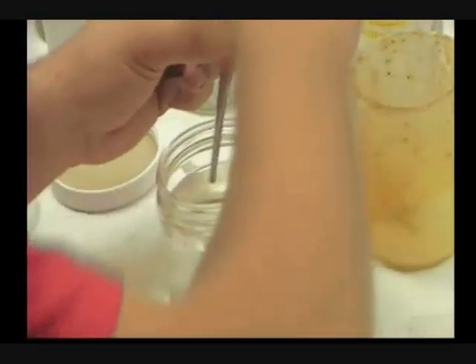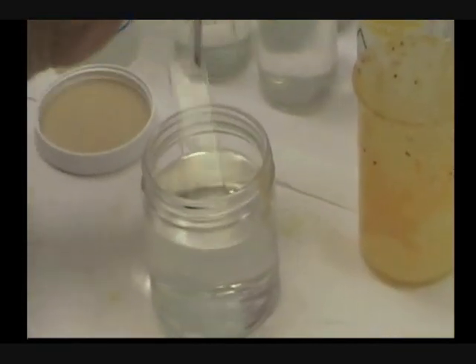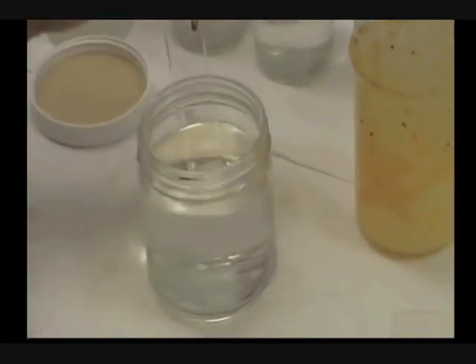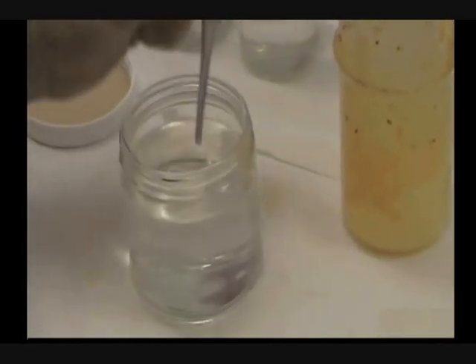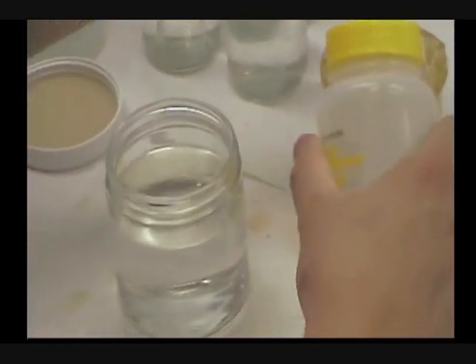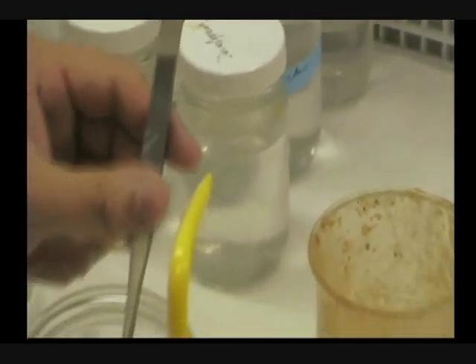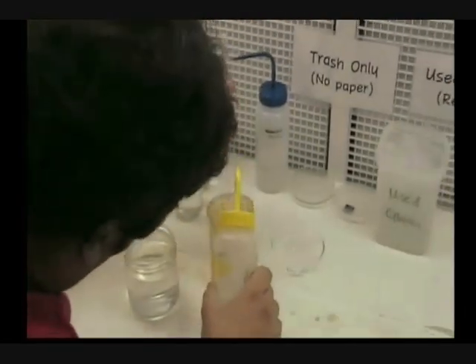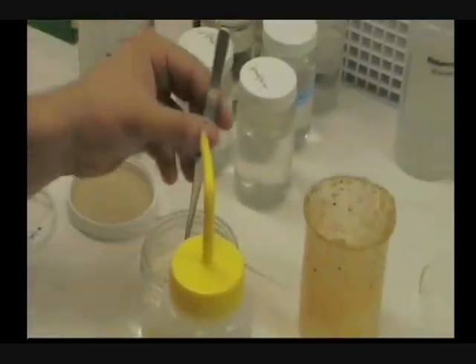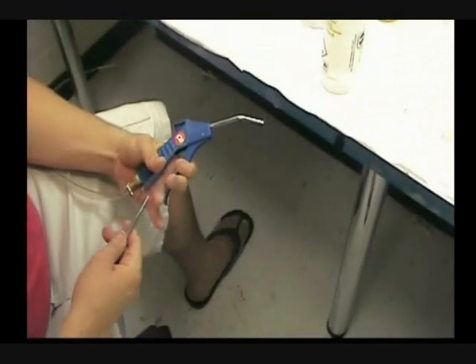From time to time I'm gonna wash my glass slide with alcohol to see if it is developed or not. Now these white strips mean it is still developing, so I need to put more. Now I am gonna blow the air very gently.